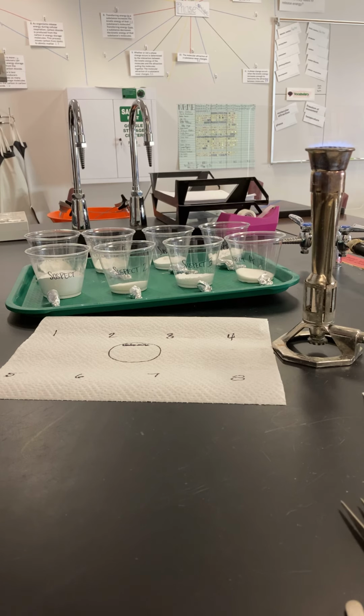Okay. All right. So we're just going to start right off the bat and we're going to go into suspect 1 substance. I'm going to melt these for about 5 seconds. And then if they don't melt, remember, we're going to assume that they're a high melting point. If they do melt, I'll tell you how long it took them to melt. And then you guys can use that time frame. Obviously, if it melts within 5 seconds, that's also a low melting point.